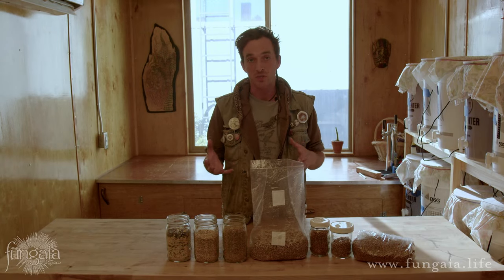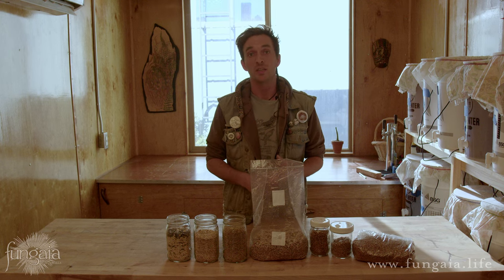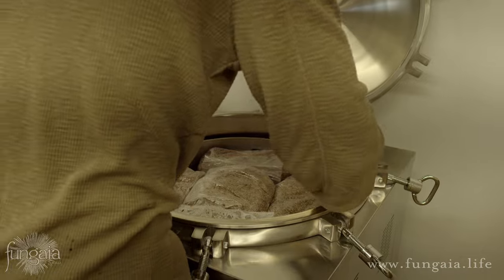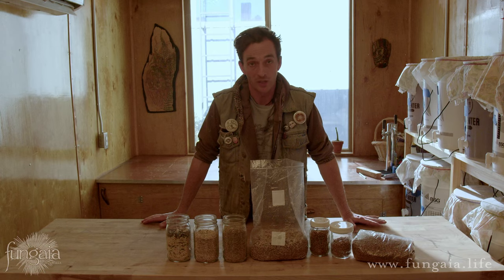First I'm going to talk about the different types of grain and the general process. I'll go over what materials you're going to need, and then at the end I'm going to show you how to scale this process to do larger quantities of grain at a time if you're a commercial mushroom producer and want to streamline your process.